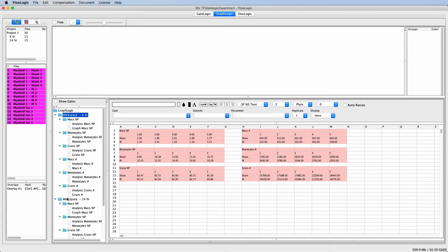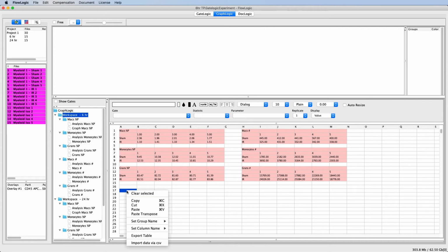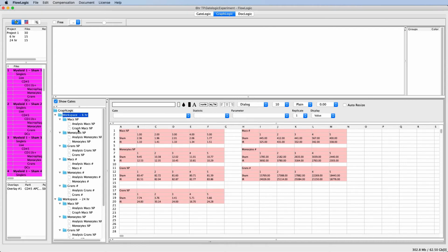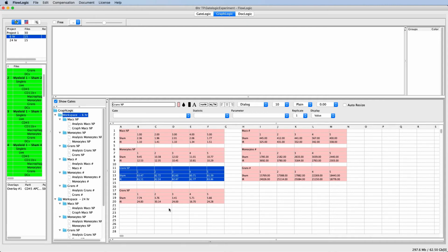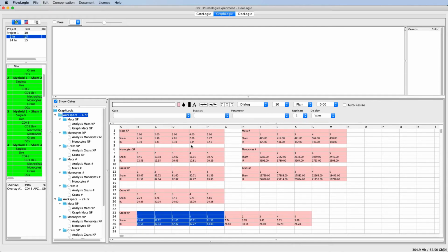One of the huge advantages of being able to import an entire analysis is that those newly imported files can then be analysed directly with the existing files. So here I will perform a grouped analysis where I will combine the files from 2 different time points. To consider the 2 independent variables, I will paste the tables for each time point side by side. I will then colour these just to help distinguish them.